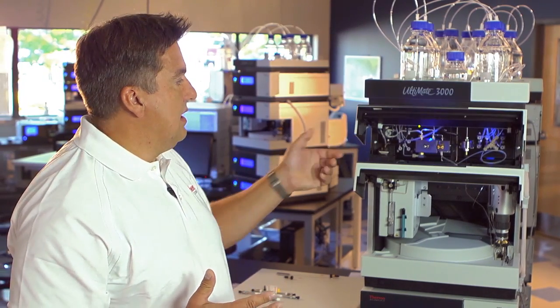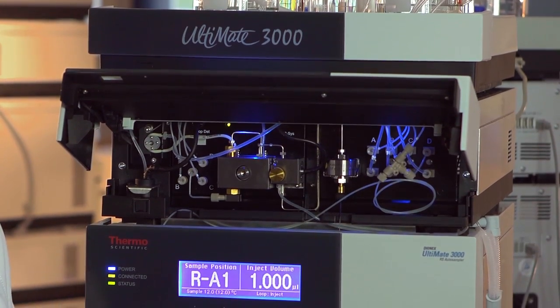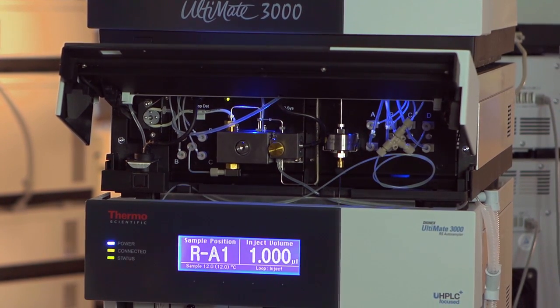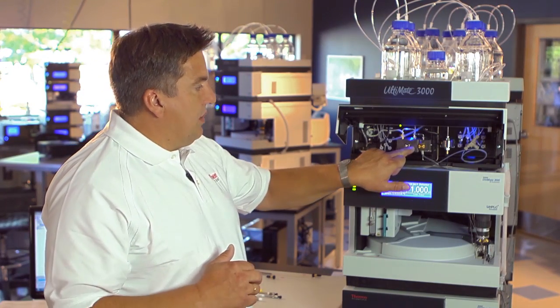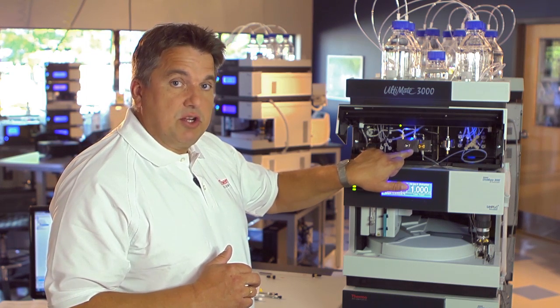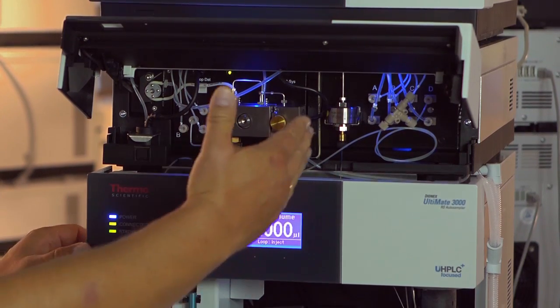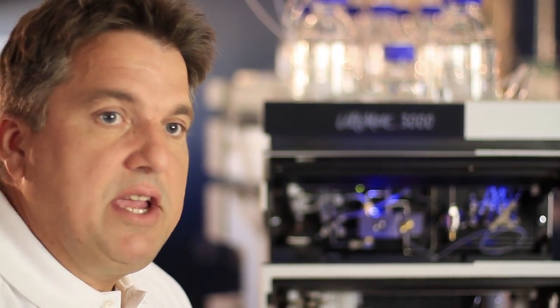One of the reasons why this is so easily possible with the Ultimа 3000 is the design of the pump. The internal volumes are really the same independently if you work with a 1000 bar or with a 620 bar system, so every method developed by your R&D colleagues can easily transfer into a QC environment. The entire internal volume, which is the delay volume on this low pressure gradient pump, is similarly designed and the flow path is exactly the same.